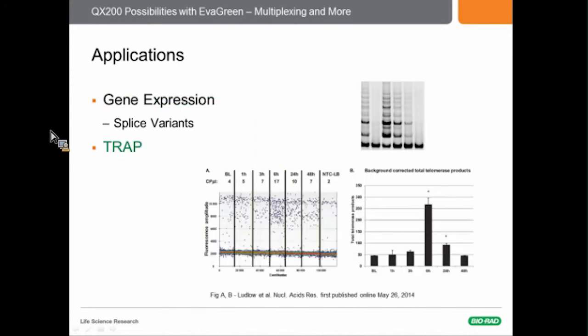The ddPCR TRAP assay is not only much quicker and technically easier to perform, but also allows for increased sensitivity and accuracy of quantification of telomerase activity at the single cell level as compared to traditional methods of PCR or radiolabeled gels. TRAP directly measures the addition of telomere repeats to a telomerase substrate and detects extension products via radiolabeling on a polyacrylamide gel or by PCR. In ddPCR, the absolute number of telomerase extended DNA molecules instead is quantified from very small cell numbers, such as in clinical samples.